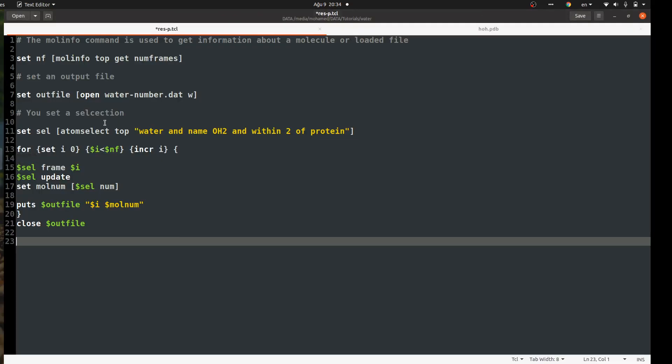In the first line: 'set nf molinfo top get number of frames'. The molinfo command is used in VMD to get information about your loaded trajectory. Here I use it to get the number of frames, and then I assign it to a variable called nf because I will use it later in my calculation.